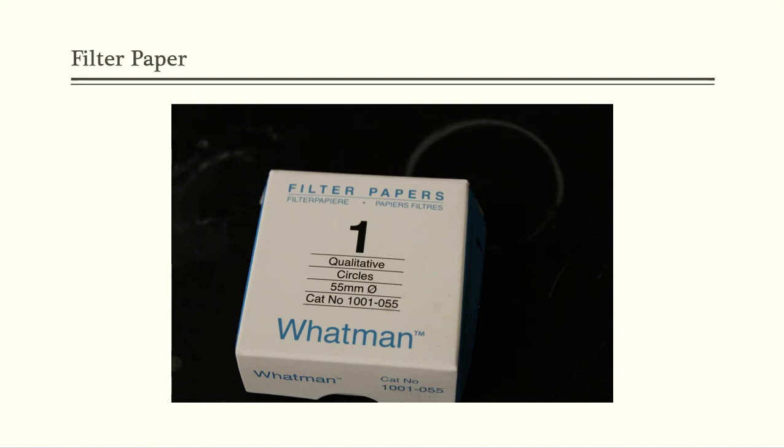All right, here's a picture of a piece of filter paper that I used. It's a Whatman grade 1 filter paper. These are cut perfectly for the Buchner funnels that we use in our laboratory, and I don't really have any overhang on it. Some people like that, some people don't, but this is just what I grabbed that day when I was in the lab, so no big deal. And there are different grades of filter paper because the different grades relate to the pore size.